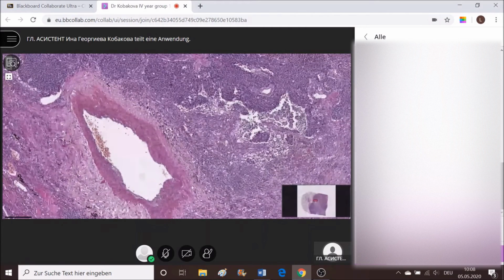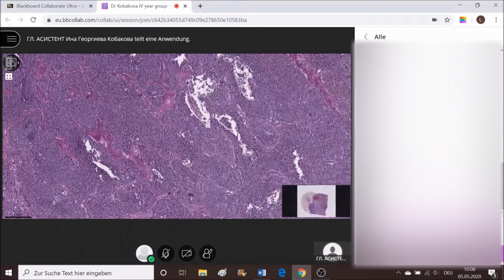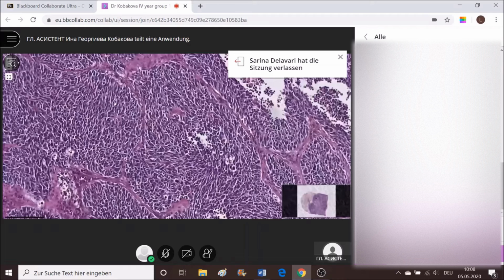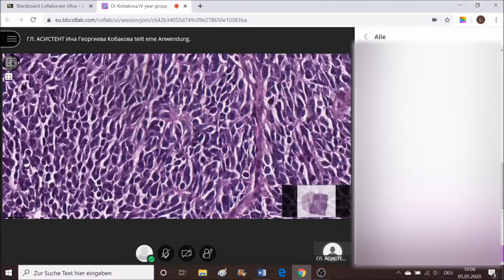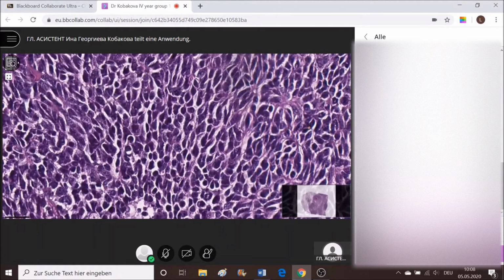Anyway, so what we observe here is majorly the same arrangement of cells which are pretty much appearing identical to each other. No evident nucleoli inside, just clusters of chromatin in hyperchromatic nuclei, which have the manner of arrangement of salt and pepper. You can see how it's looking granulated, as if there are lighter fields inside the nuclei and darker fields, as if salt and pepper mixed together.